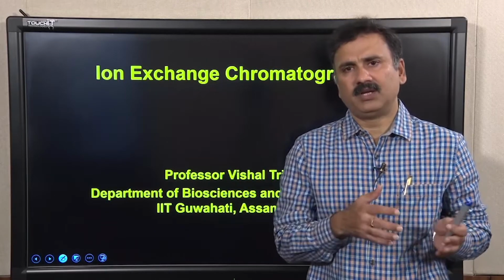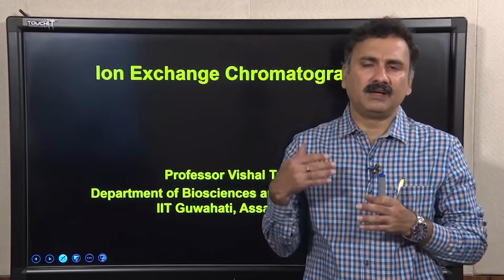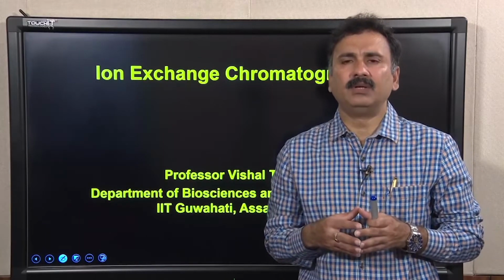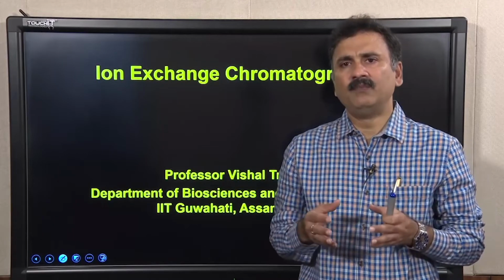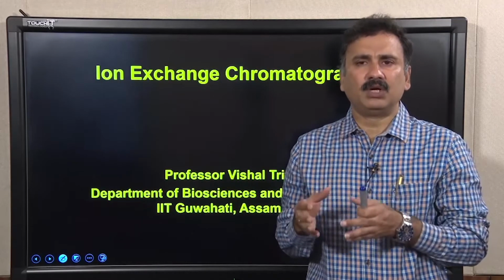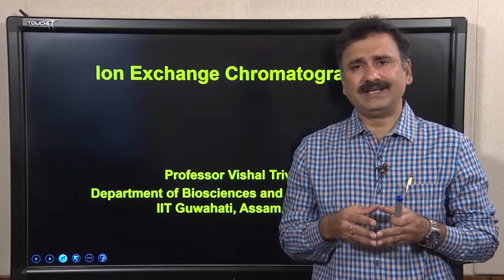In our previous lecture, we were discussing the basics of the separation techniques, and then we started discussing the different aspects related to chromatography. In that context, we also discussed the protein purification system, and we showed you a small demo of how to operate a typical chromatography system and what the different steps and precautions are. Following that discussion, today we are going to discuss the different chromatography techniques.